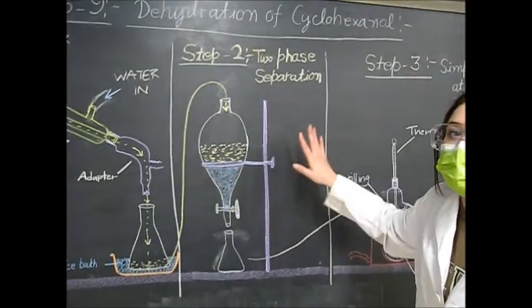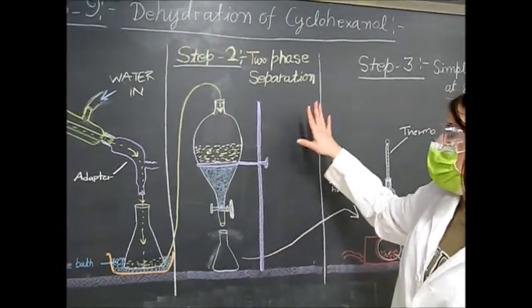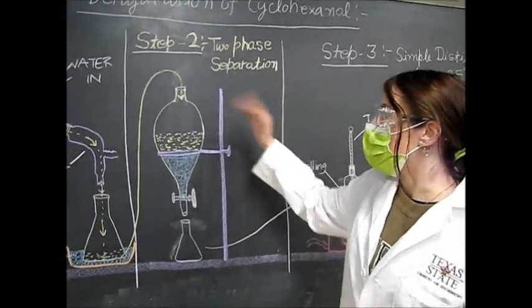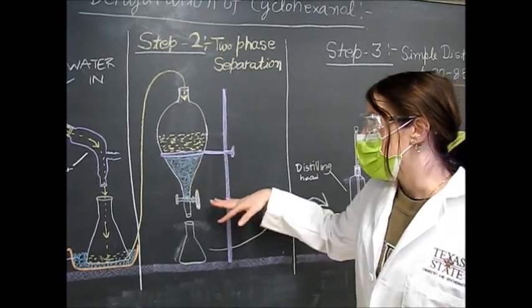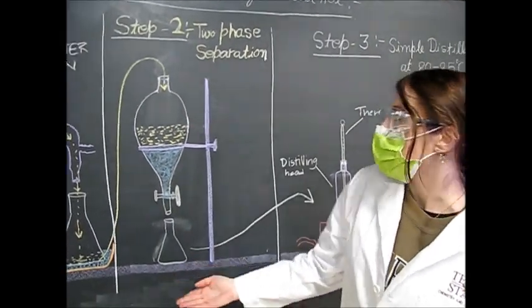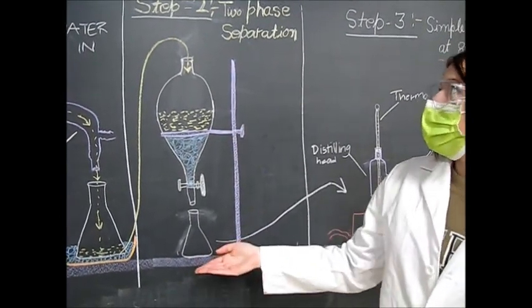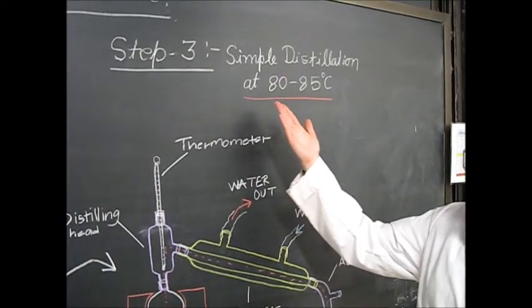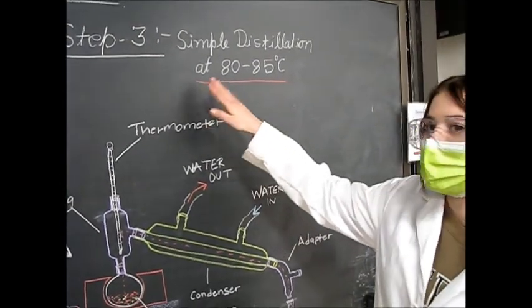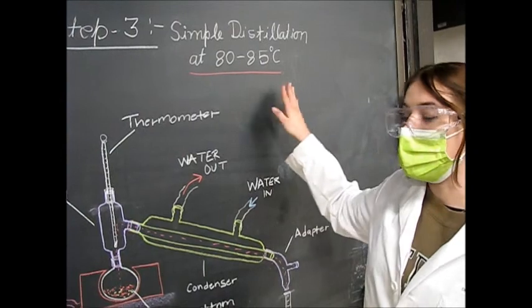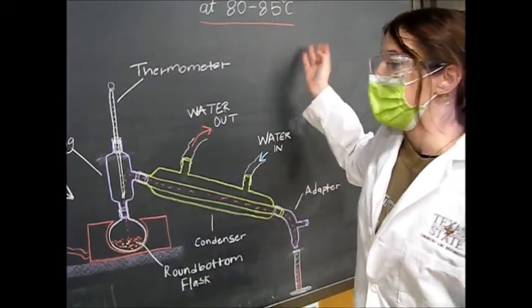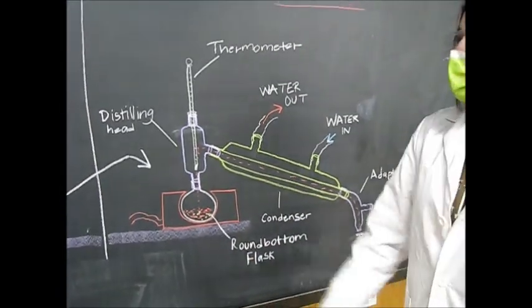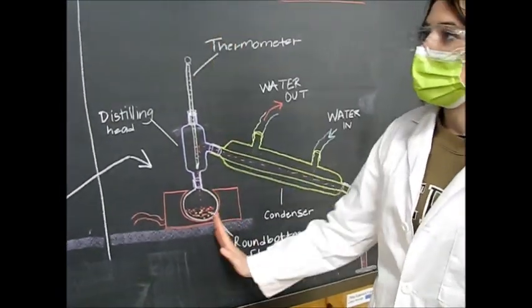The second step in this experiment is two-phase separation using a separatory funnel — creating an organic phase and an aqueous phase which we will separate into a receiver. The organic phase collected from this step will be used in the third step: simple distillation. We will only want the product that distills out from 80 to 85 degrees Celsius — this will be our cyclohexene. The simple distillation apparatus is similar to the fractional distillation apparatus except we do not have the large fractional distillation column.